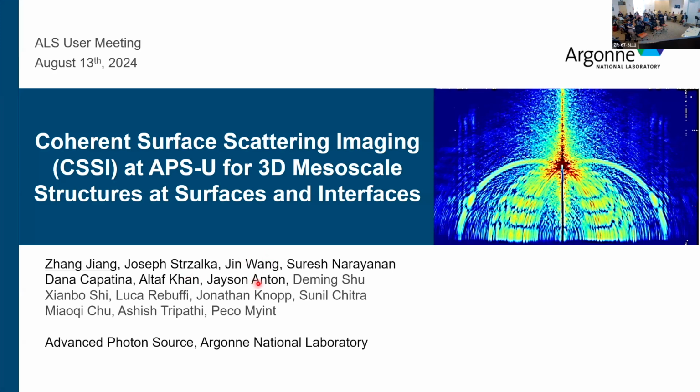Okay, so I'm a beamline scientist at the APS, and you all heard recently we made a milestone. We got the first light into the ring, and some of the beamlines also got light into their experimental hutch. For the featured beamlines, you probably heard there are a couple, and I was helping one of them to do technical and scientific commissioning. This is XPCS. I cannot talk too much because you can read the news release, but I can say 48 hours ago, we got the first speckle pattern on this beamline. Very nice. So basically the beam is back.